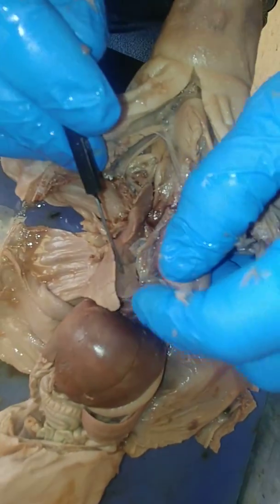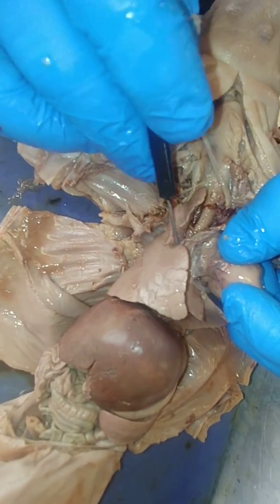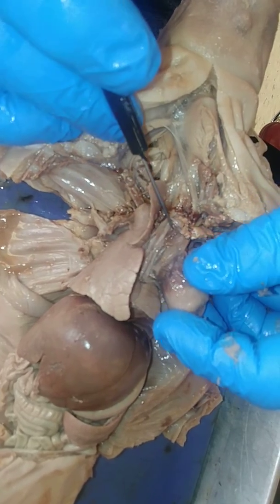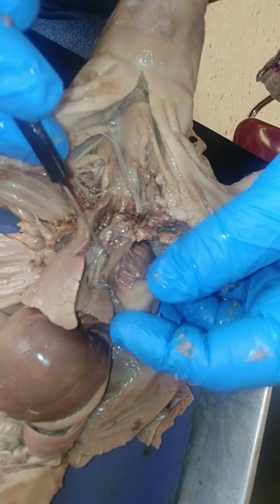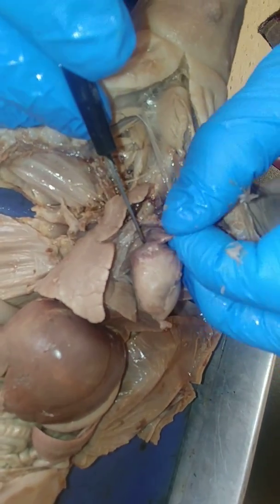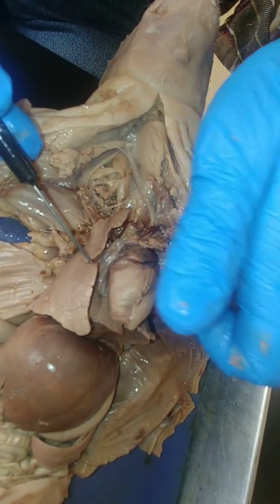And what we're going to do next then is look at some of the blood vessels here connecting in down here, and this might be a little bit difficult to see, but this is on the right side. This would be the inferior vena cava. And then up here is the superior vena cava, connecting right here in what they call the vena cava, and that would be going into this upper chamber of the heart. This is all kind of flattened out right now, so the heart might be as big as my thumb when it's full of blood.